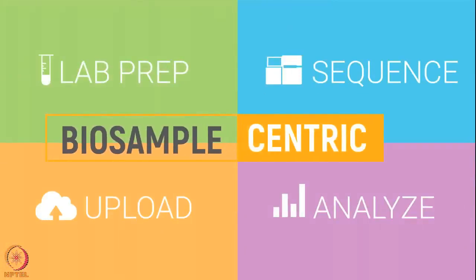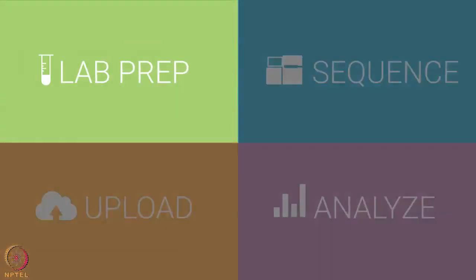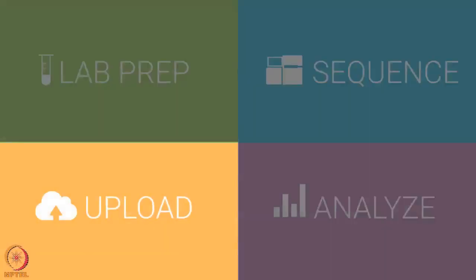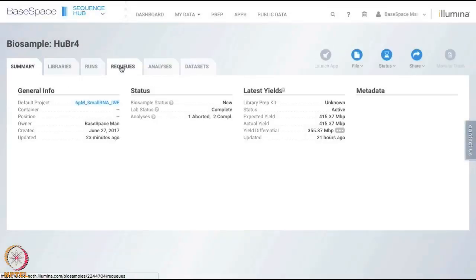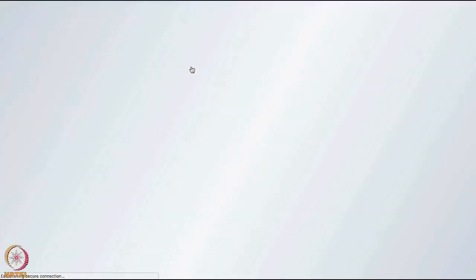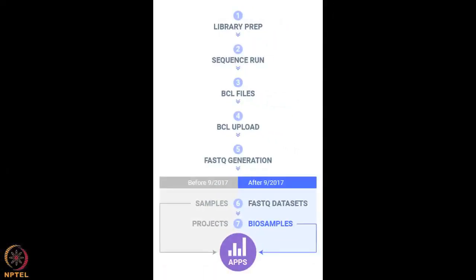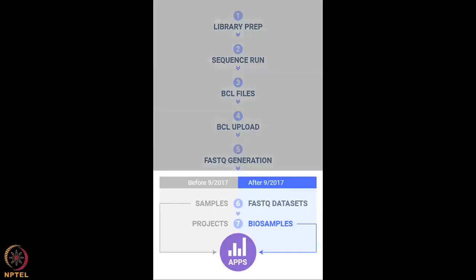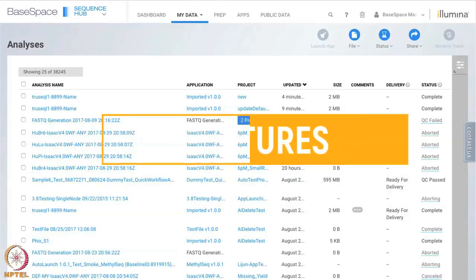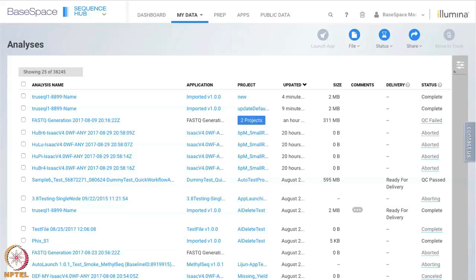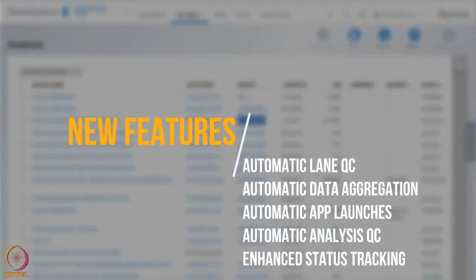The new biosample-centric data model lets you easily track all biosample activity from lab preparation through sequencing, processing, uploading data to the cloud, and analyzing results. Biosamples support data aggregation and can be linked to multiple libraries, runs, requeues, and analyses. FASTQ data sets have replaced samples and are now stored inside of biosamples. BaseSpace Sequence Hub also includes new features to automate analysis workflows, including automatic lane QC settings, automatic data aggregation, automatic app launches, automatic analysis QC settings, and enhanced status tracking.